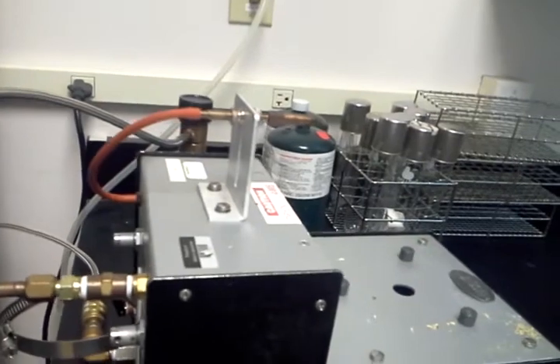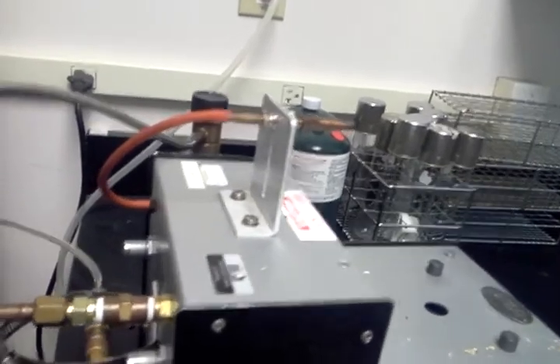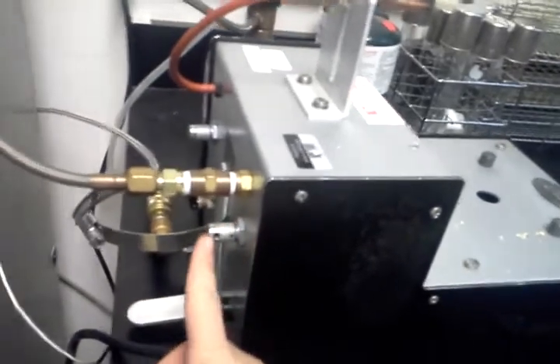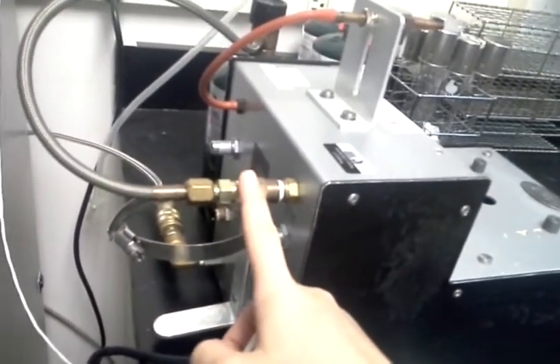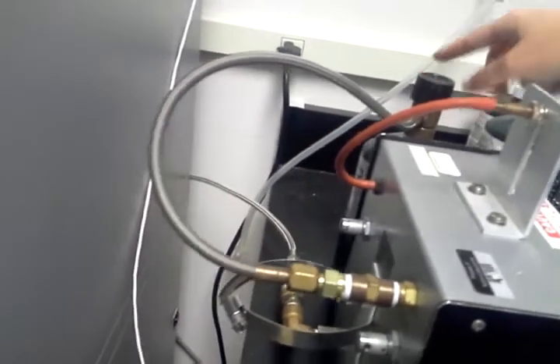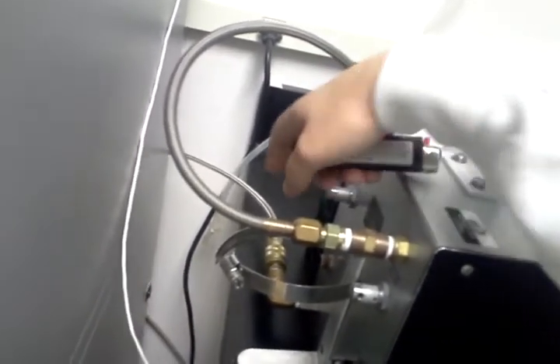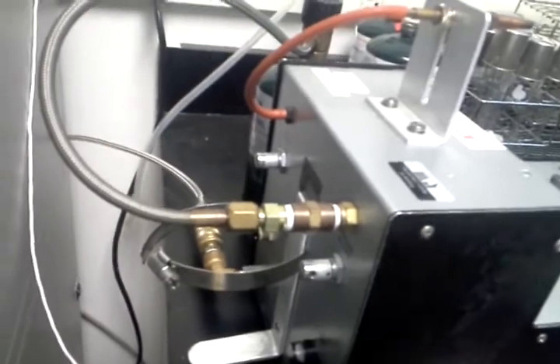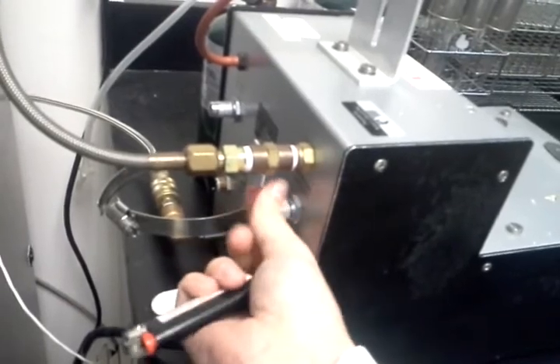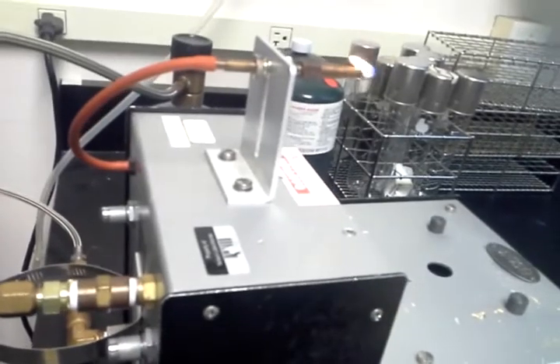Now, here's the tricky part that I'm not sure I can do with the camera in my hand, but I'm going to try it. This nozzle controls the level of propane, and this nozzle controls the oxygen tank that I just hooked up. So I have to turn the propane on and then light the nozzle. Oh my god — that was easy.